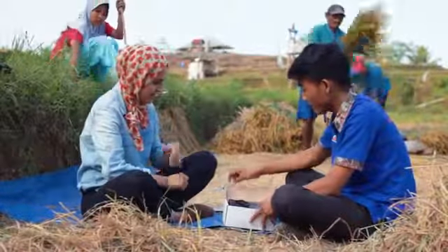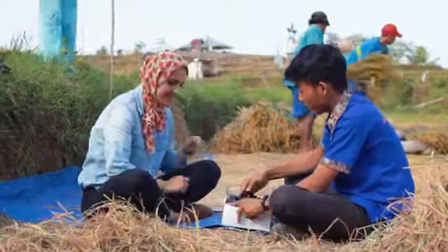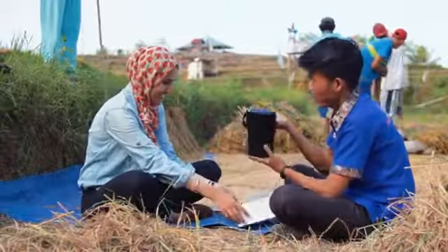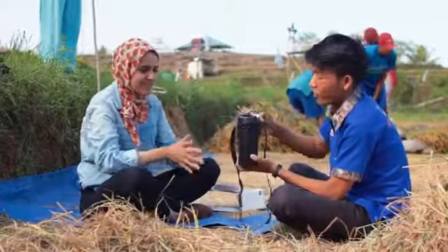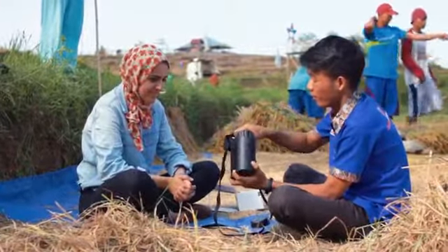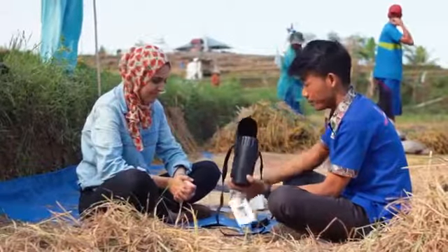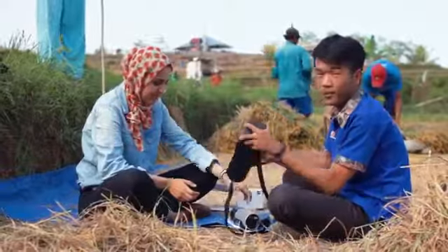Di dalam box ini terdapat apa saja? Di box ini terdapat sebuah tas. Kemudian di isi tuff-nya ada alat ukurnya. Kemudian ada manual book. Kemudian ada baterainya.